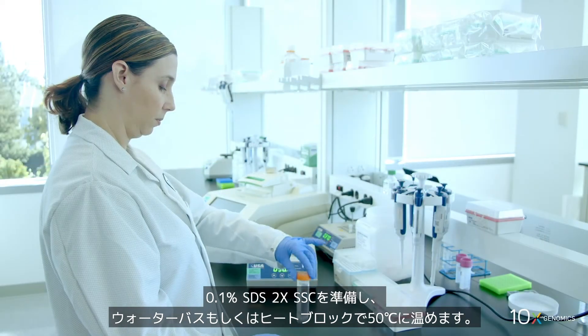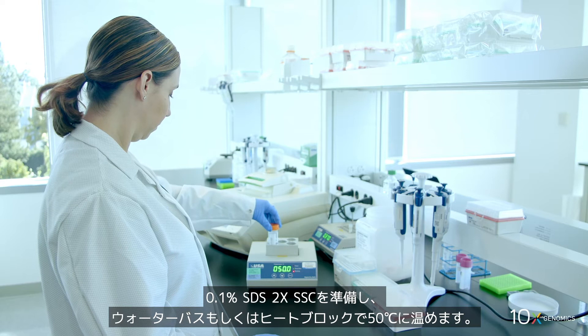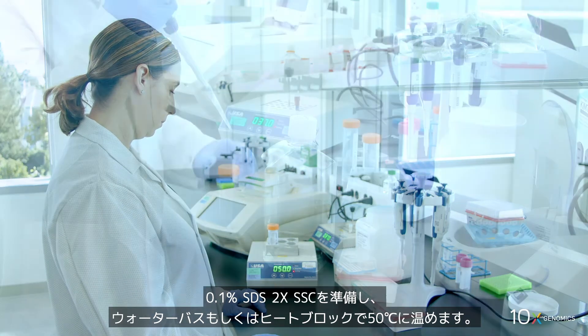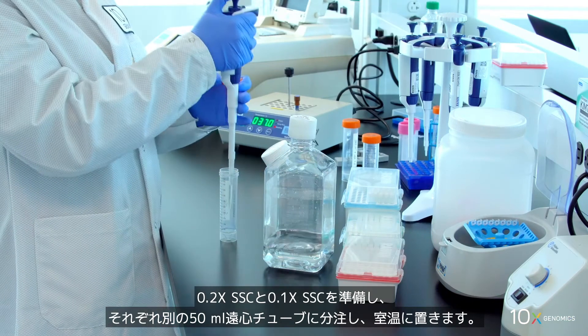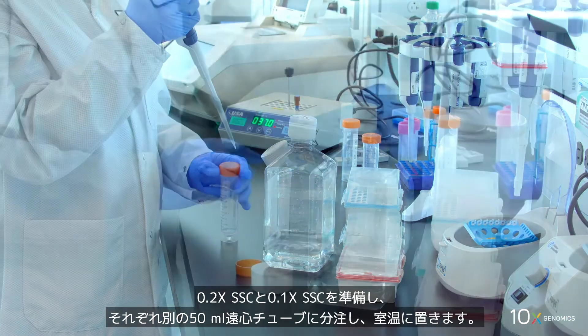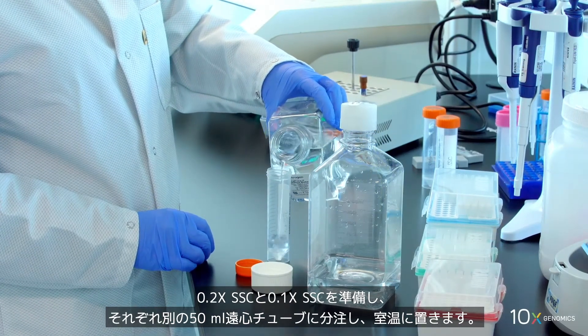Prepare 2x SSC with 0.1% SDS and pre-warm to 50 degrees Celsius in a water bath or heat block. Prepare 0.2x SSC and 0.1x SSC buffers in two separate 50 ml centrifuge tubes and maintain at room temperature.